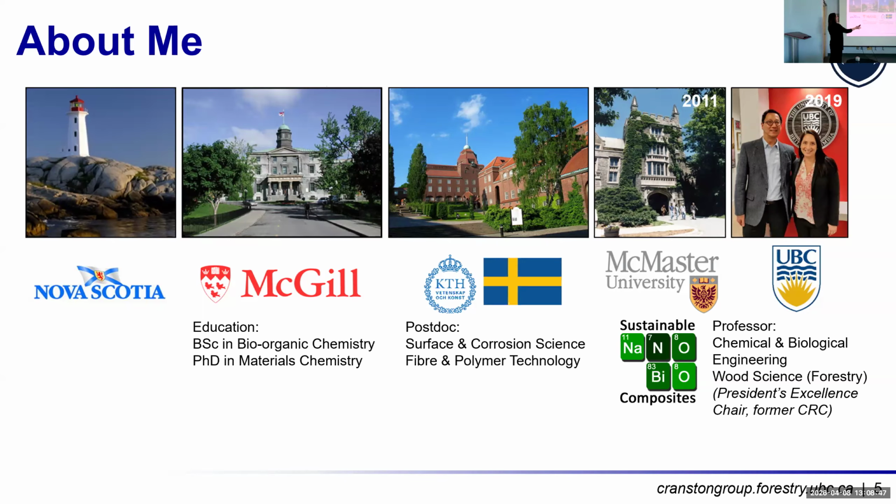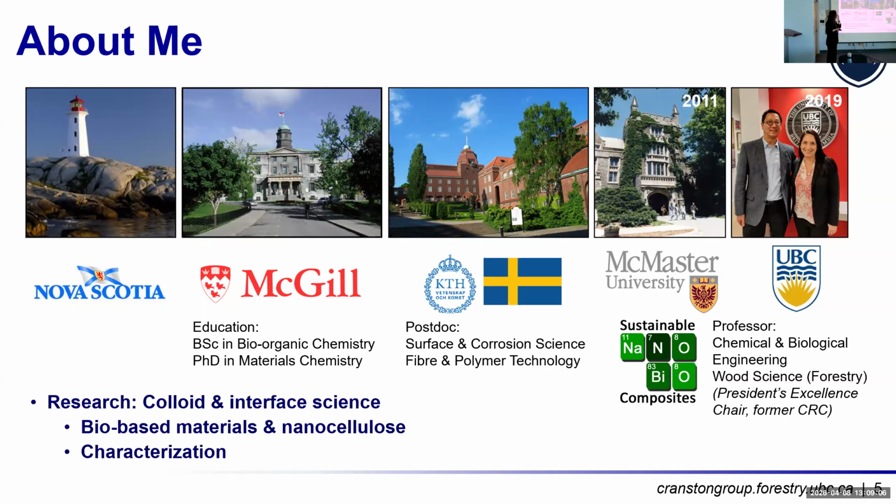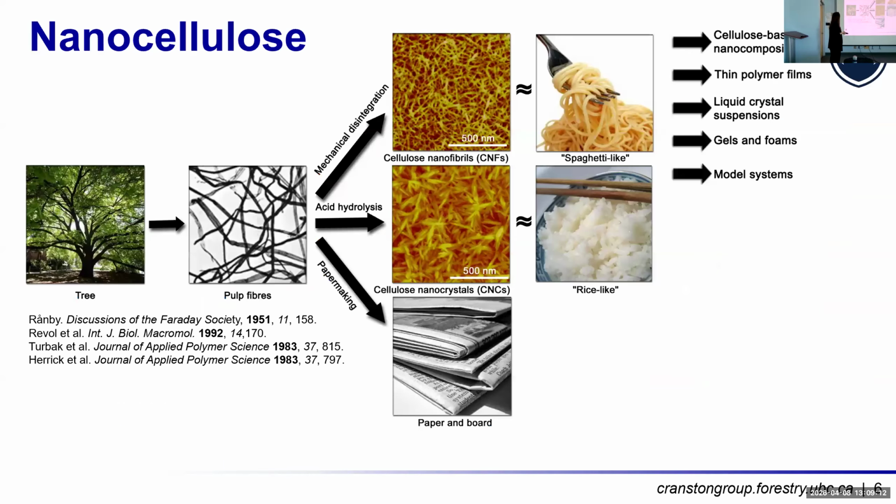And so the reason that I'm telling you this is because actually today I'm going to tell you about research that's done at almost each one of these stages, and that's pretty rare for me. I normally talk about very recent work, but I wanted to pull different AFM examples so it comes from different points in my career, which is kind of fun. So overall, my research is on colloid and interface science with a focus on bio-based materials, biopolymers, and nanocellulose.